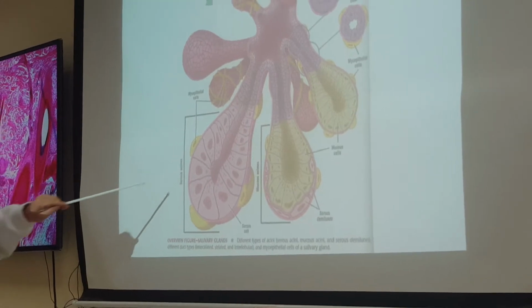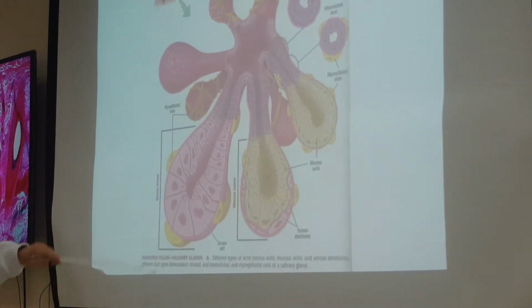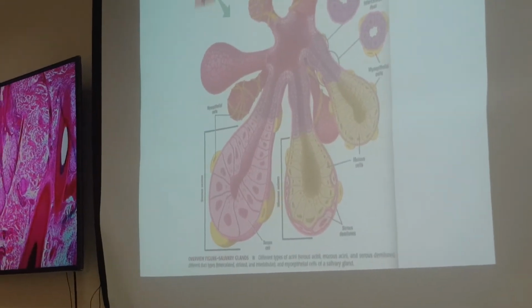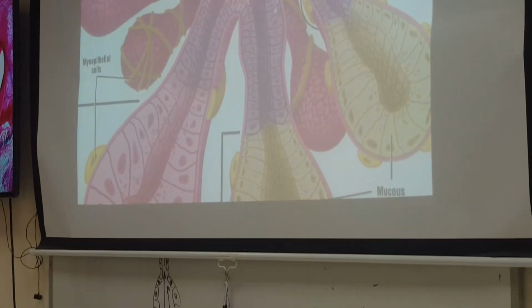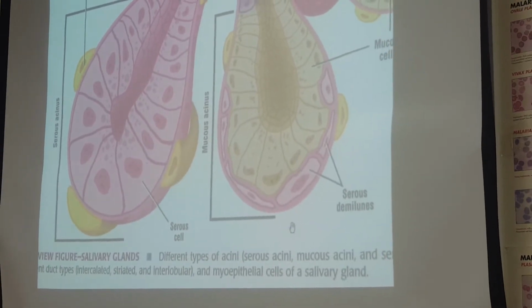It's here. Already you covered it in the theory. Serous acinus arrangement. It's written here. I will magnify it a little bit. They are just next to each other.